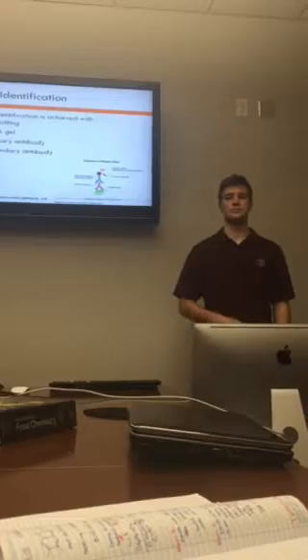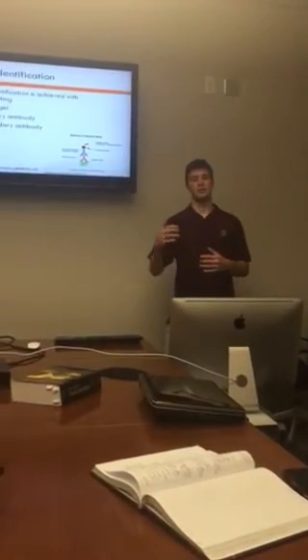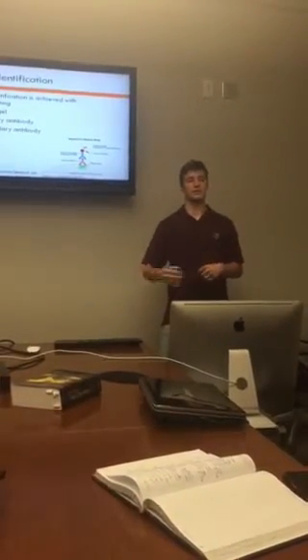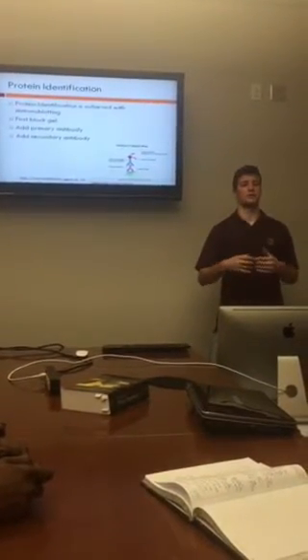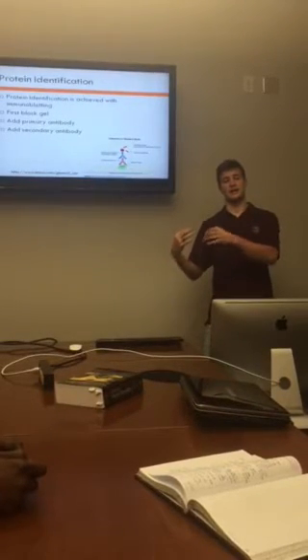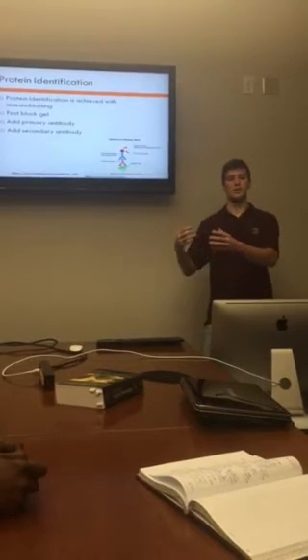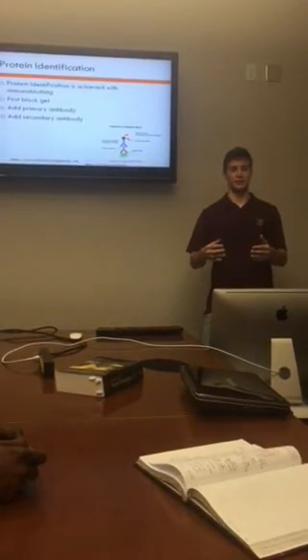Interesting. How do you generate your primary antibody? Primary antibodies are generated by, you can either have a hybridoma, which is an immune cell that's fused to a cancerous cell, so it's continuously proliferating, and then you would have selected the initial immune cell from maybe a goat or a rabbit that had been inoculated with your protein of interest.